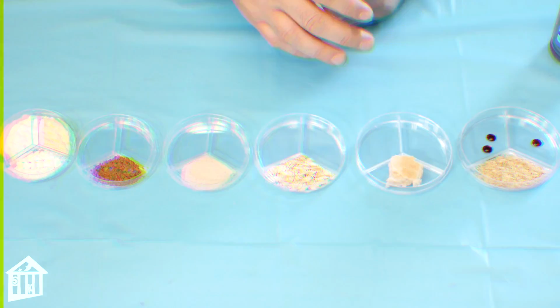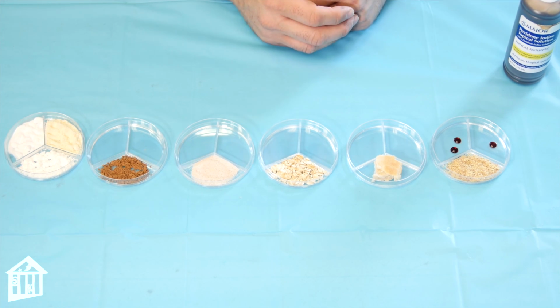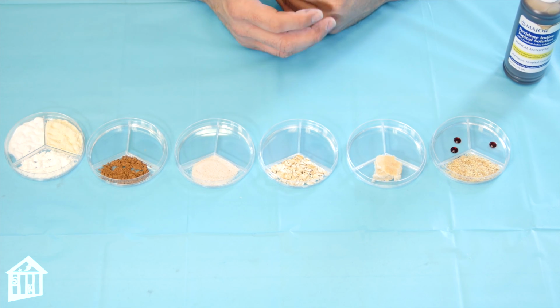So what we're going to do right now is show you how you can identify starch in all kinds of different foods. You can test all kinds of stuff at your house by using something called iodine. Let's get a little closer so we can see what's going on. So right here, I have a bunch of different petri dishes with a lot of different food products. In fact, I'm not even quite sure what everything is because I had my friend pick it out for me and I wanted to be surprised myself.